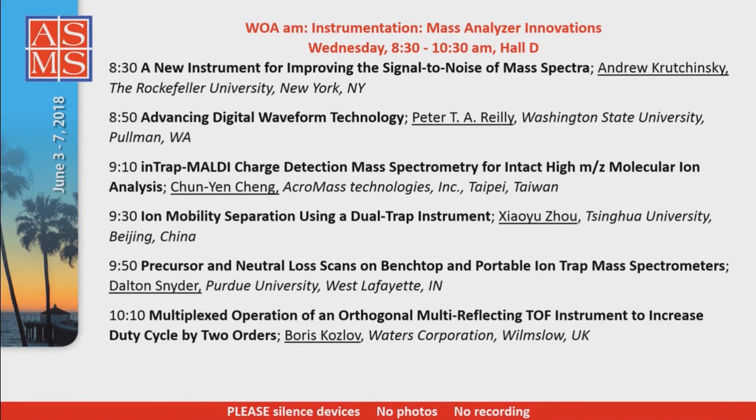Yes. Well, thank you very much for your talk. It's amazing. So the question is, can you do the other way around? Instead of depleting +2, +3, +4 ions, actually focus on +1 ions? Yes, we can. I just didn't want to complicate things, but we found conditions where we can enrich singly charged ions versus multiply charged ions by reversing this small potential to slightly negative, and it sucks out multiply charged species more readily than singly charged. But we haven't investigated this in detail yet.